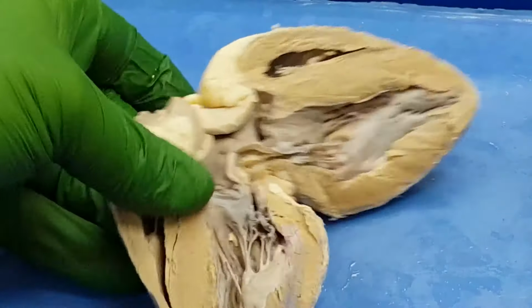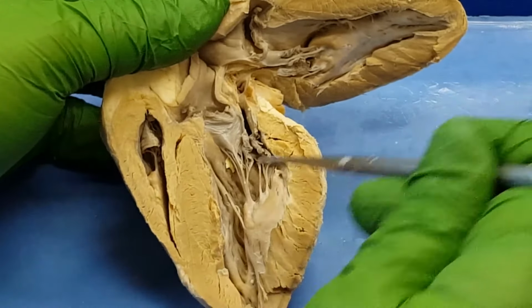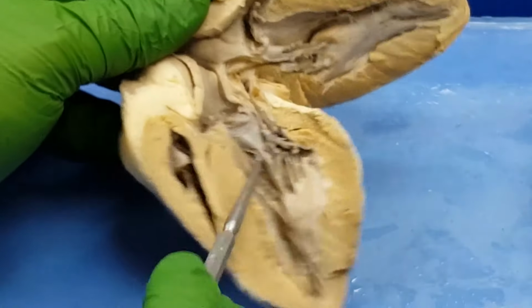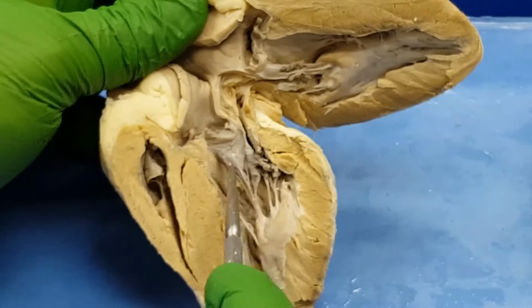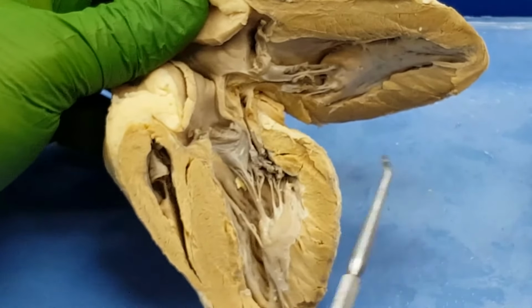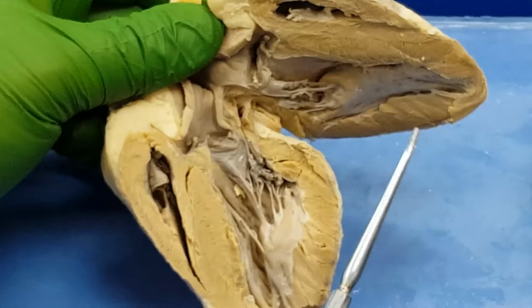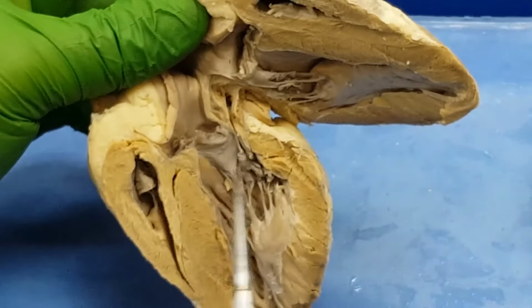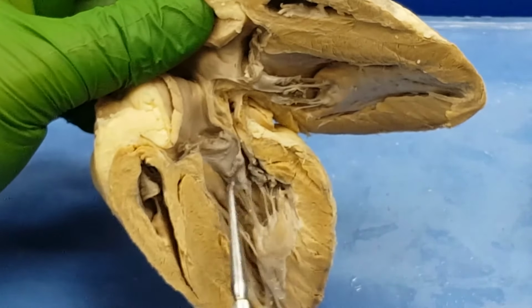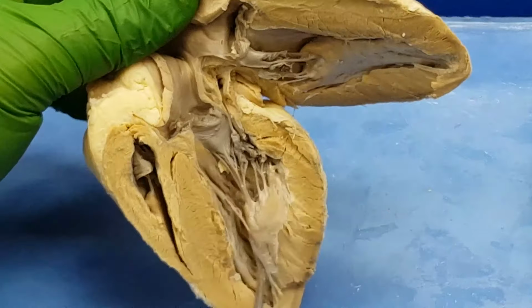I'm just pointing it out to you because I can see them stuck right here at the bottom of the cords. The reason I show you the chordae tendineae right now is because they're attached to the flaps, remember, of the valves that separate the atrium from the ventricle. The AV valves, or in this case, on the left side, this is why we do the models first. I'm shaking my probe at you. This one is the what? Mitral valve. So I follow the cords up right to the mitral valve here at the top of the left V-shaped ventricle.